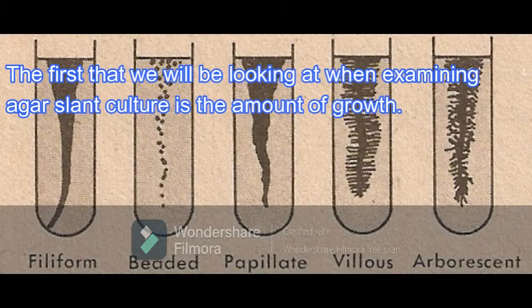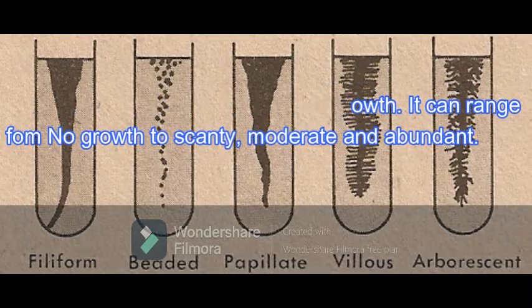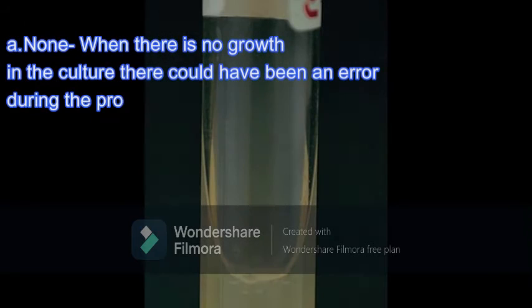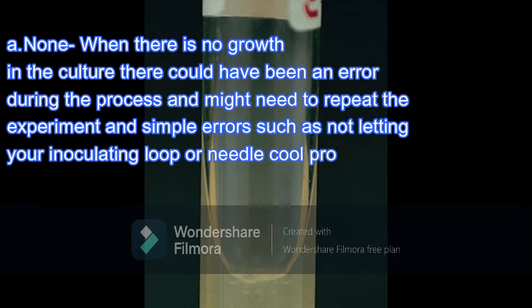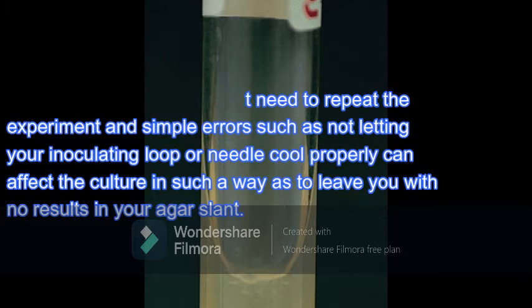The first thing we will be looking at when examining agar slant culture is the amount of growth. As said previously, it can range from no growth to scanty, moderate, and abundant. Starting from the bottom, we have none. When there is no growth in the culture, there could have been an error during the process and you might need to repeat the experiment. Simple errors, such as not letting your inoculating loop or needle cool properly, can affect the culture in such a way as to leave you with no results in your agar slant.